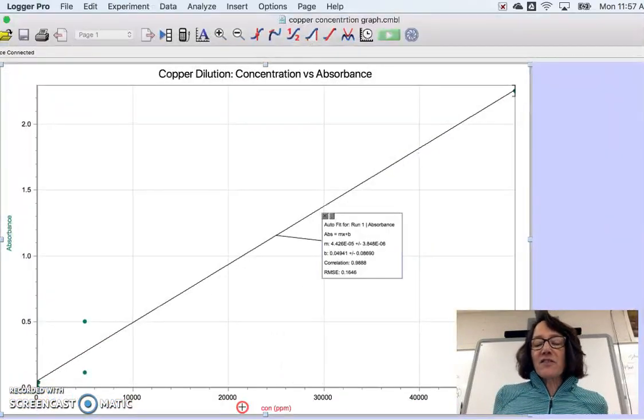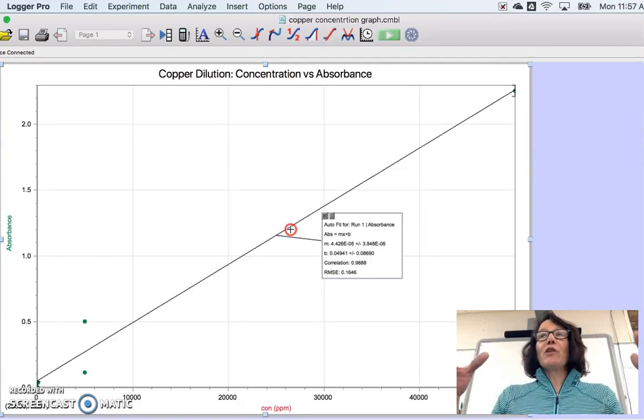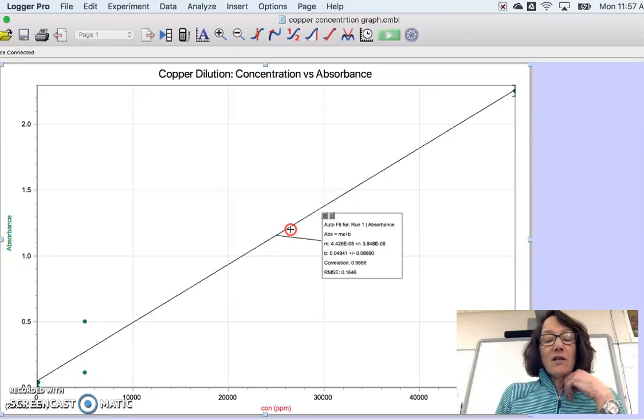Let's kind of wrap up our pre-lab video by looking at this idea of a standard curve. So the colorimeter, as we mentioned, is going to be measuring the absorbance, which is my dependent variable, and the absorbance is dependent on the concentration of the solution in parts per million. Once I get all of my data points locked in, I'm going to put a linear fit or best fit line on there, and once I've got that relationship between concentration and absorbance, I'm going to put my unknown into the colorimeter, and read the absorbance of my unknown solution. I want to determine what its concentration is, and I'm going to use my best fit line to do that.